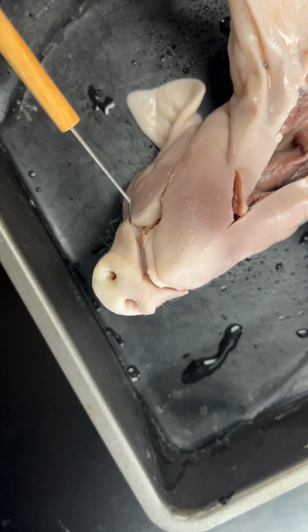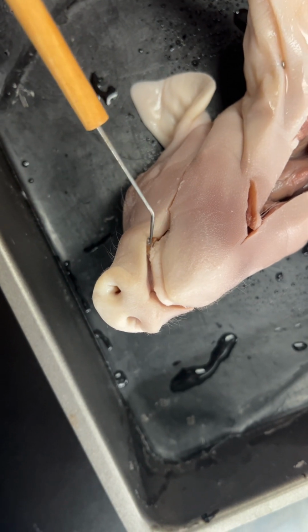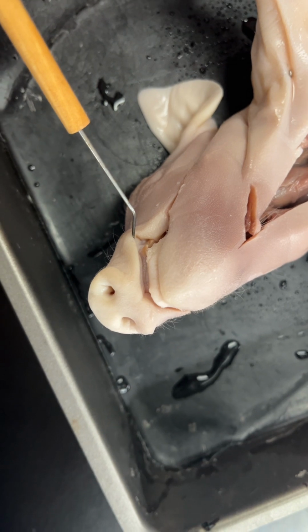That's the tooth. Only a few canine and or incisor teeth will have erupted. Other teeth are still being formed and may present as bulges of the gums. Make an incision in one of these bulges to observe them.